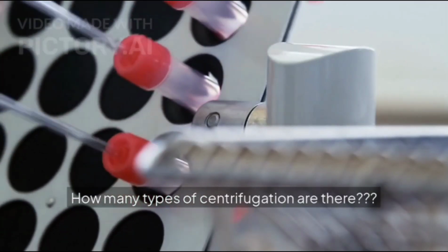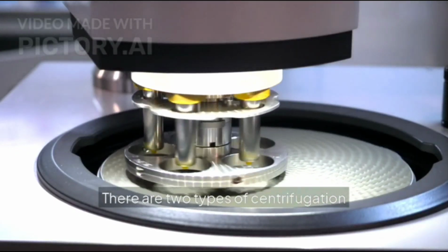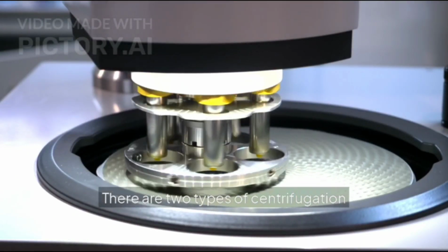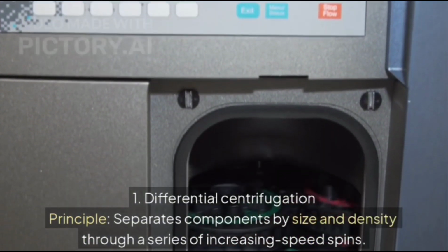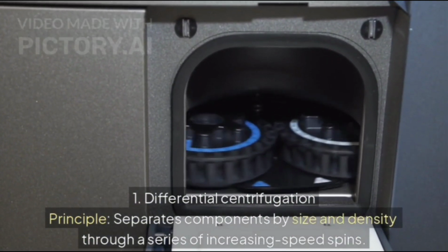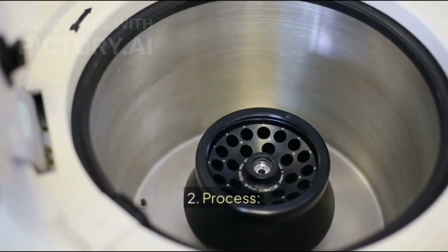How many types of centrifugation are there? There are two types of centrifugation: differential centrifugation. Principle: separates components by size and density through a series of increasing speed spins. Process.